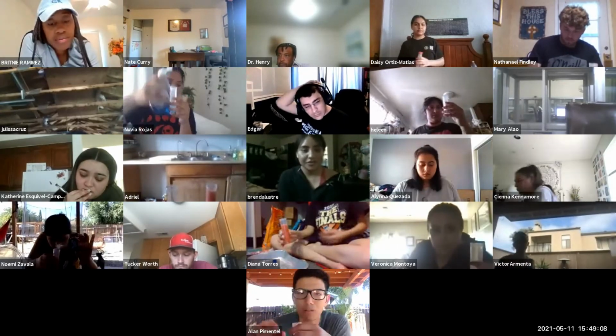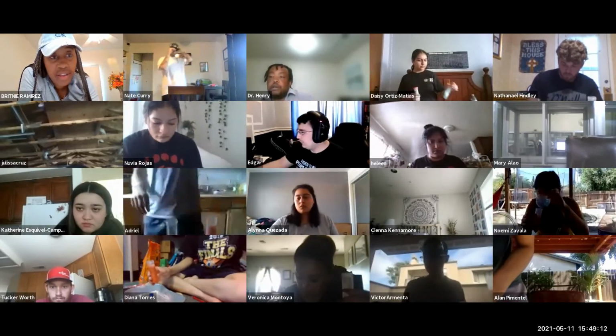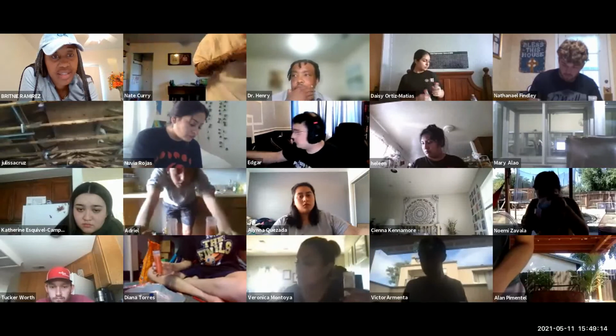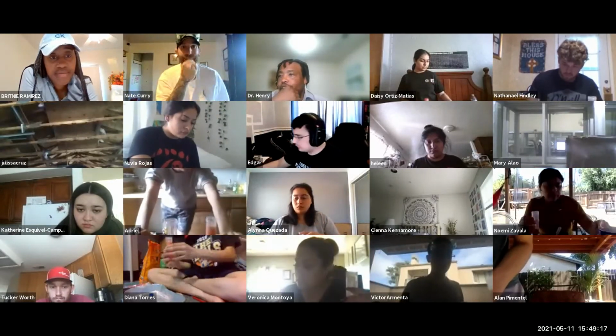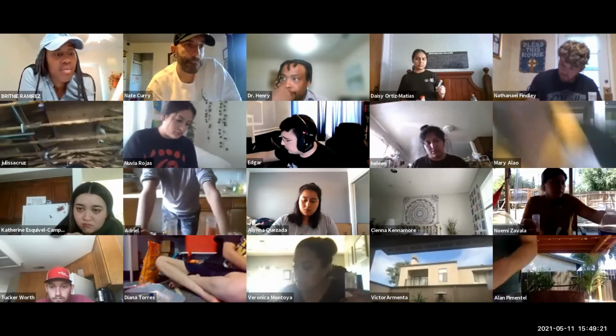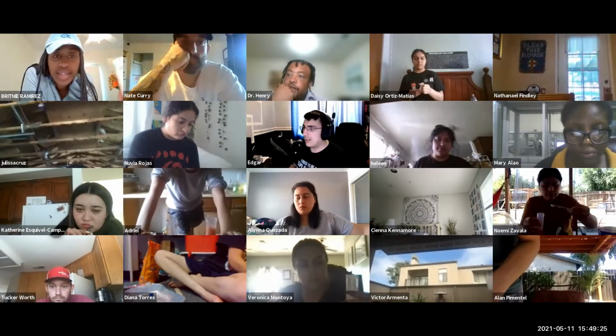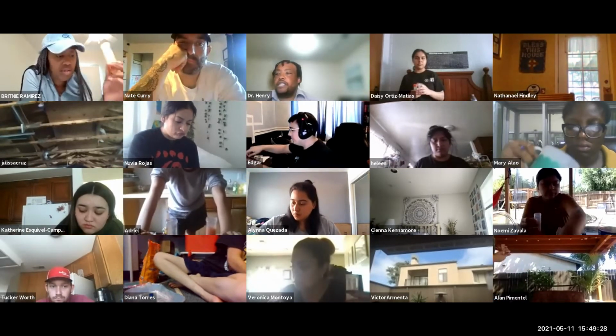Yep. All right. Okay, so then Dr. Henry, I figured out this last one. So this one was 46. Okay, so that one was 46, right? Okay. Can I toss it out or no? Yeah, you can go ahead and toss it out.